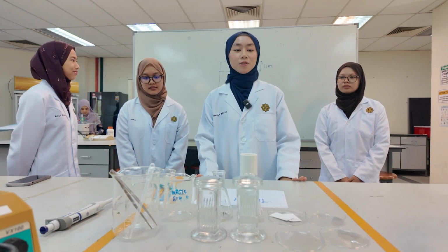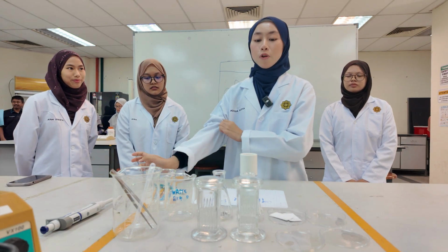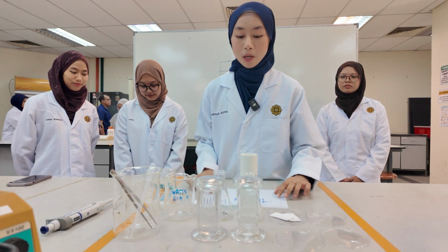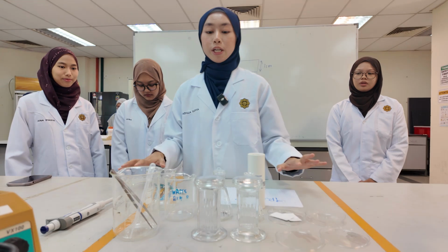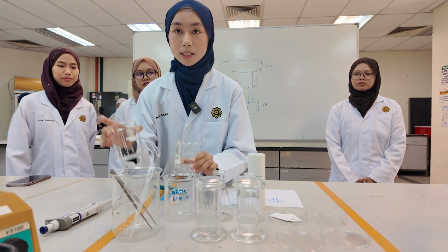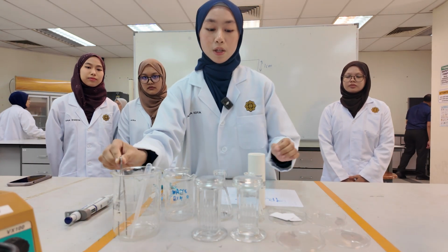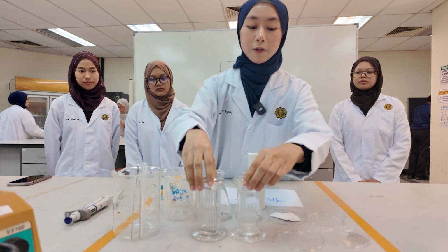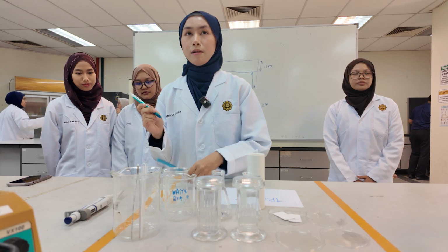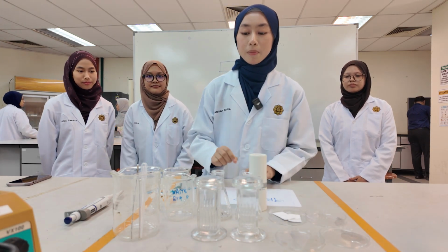Assalamualaikum and hi. My name is Adilla Sofia. Let's continue to the next part of the experiment, which is about the procedure and equipment required. Firstly, let's go through the equipment required. We need 3 beakers, 1 micropipette, 1 forceps, 2 conical flasks, 2 developing chambers, 2 TLC plates, a pencil and ruler, and also 3 capillary tubes.